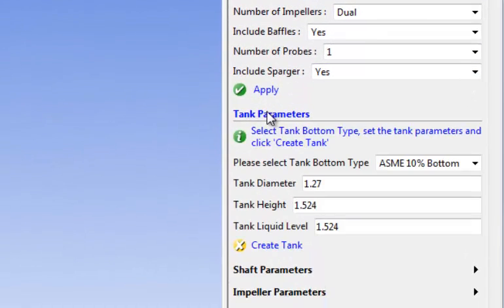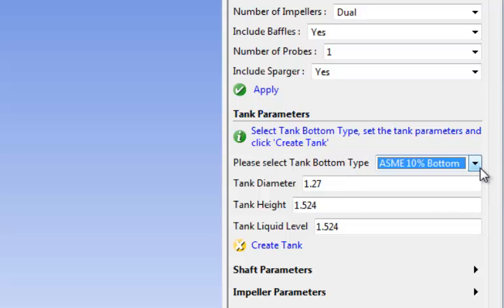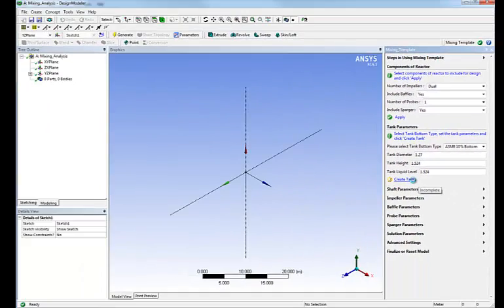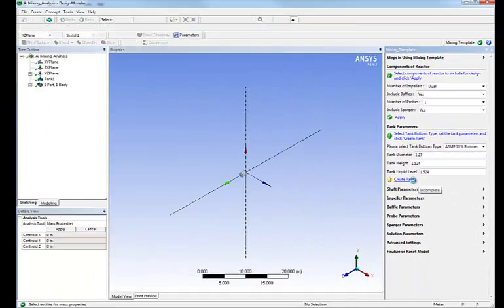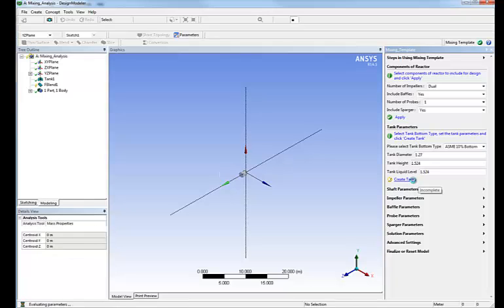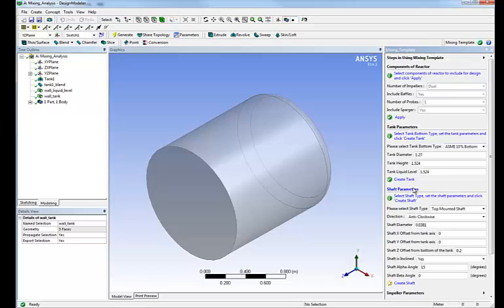The next step is to define the tank parameters. We select the tank bottom type. Here an ASME 10% bottom already pre-filled for you. We enter the tank dimensions, click create tank, and as you can see, without anything else to do, the tank is automatically created.